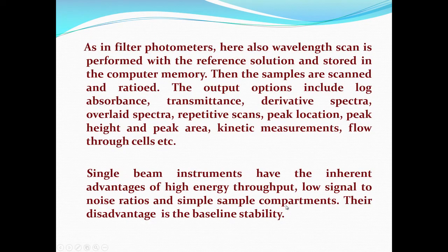So, generally what we look for is continuous online baseline measurement along with the original, which is split into two at the cost of a little bit of sensitivity. So, this is where the ingenuity of a buyer is required, exactly what is required in a given spectrophotometric cell. So, look at it like this.